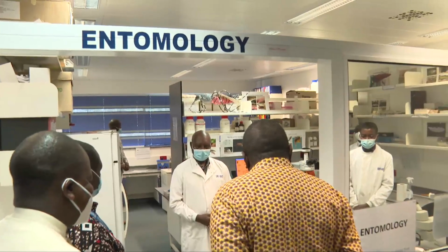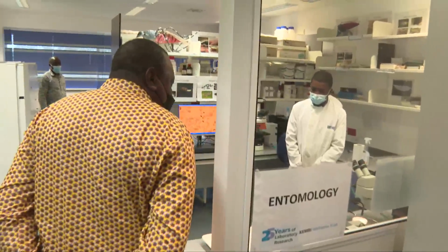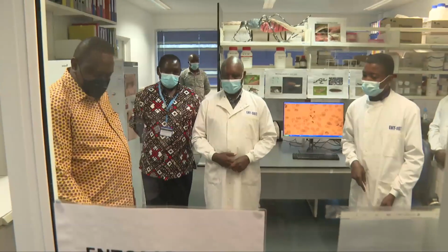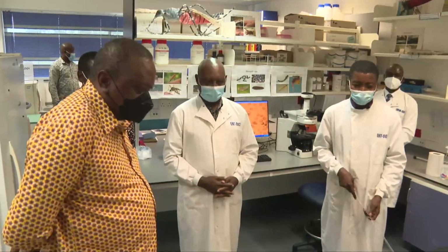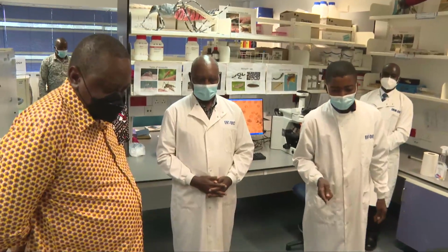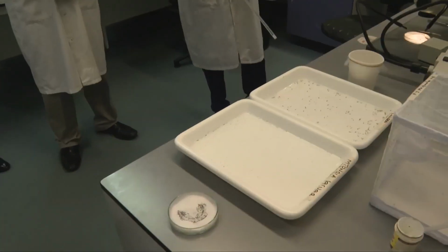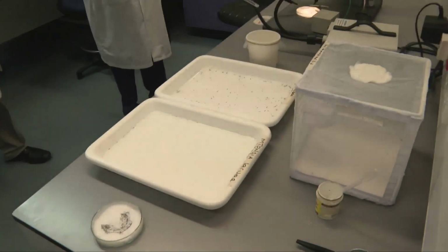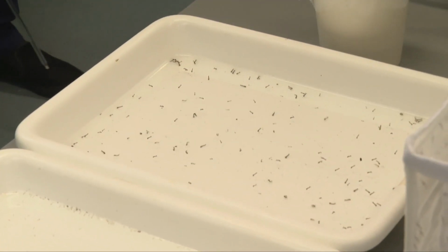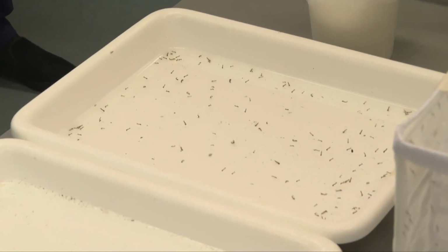Well, here's our excellency. Here is who is the enemy. Life stages. Usually it starts with the eggs, with this petri dish, the mosquito, and then after a few days it will develop into this stage. We call it larvae. And we have pupae, the next stage is pupae in this cup. And then lastly, we have some of the mosquitoes which transmit diseases in coastal Kenya.